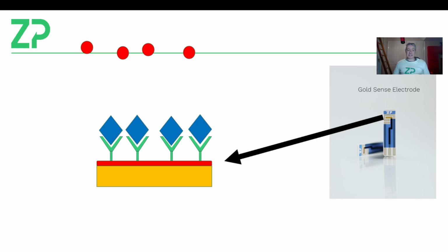It doesn't really matter because they're starting their voltammetry at a potential where if they add ferricyanide, it actually becomes ferrocyanide. So then they're reoxidizing ferrocyanide back to ferricyanide. They may be adding ferrocyanide deliberately. Sometimes people do a 50-50 mix because they're not really sure of what is happening with the electrochemistry here.